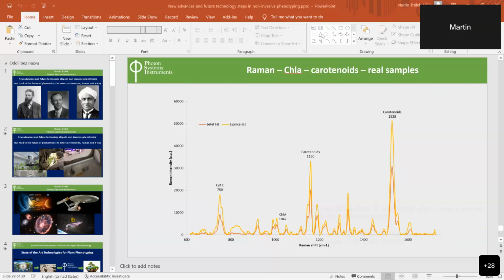So, for example, with CO2, you have the peak from the carbon, then the oxygen, and individual oxygen, or oxygen 2, and the CO2. So that's a number of peaks, and then you have to link them with these individual parts. And the same is with the Raman. Another complication, as I said before, is the signal which comes. Raman is not fluorescence, I mean, the classic fluorescence. And if there are some components which generate a fluorescence signal, they cover that part of the area. What we do then is select another excitation laser, with different wavelengths, to avoid this fluorescence.